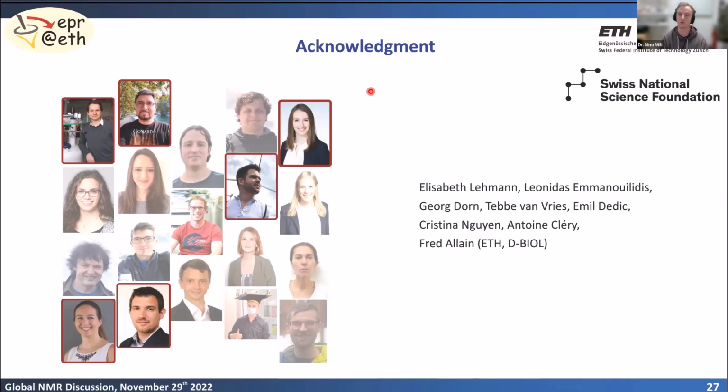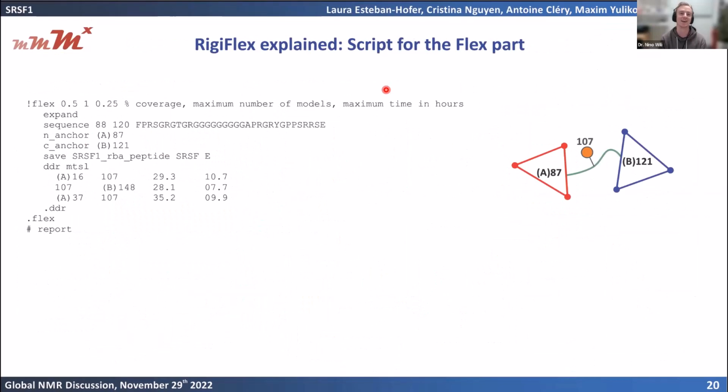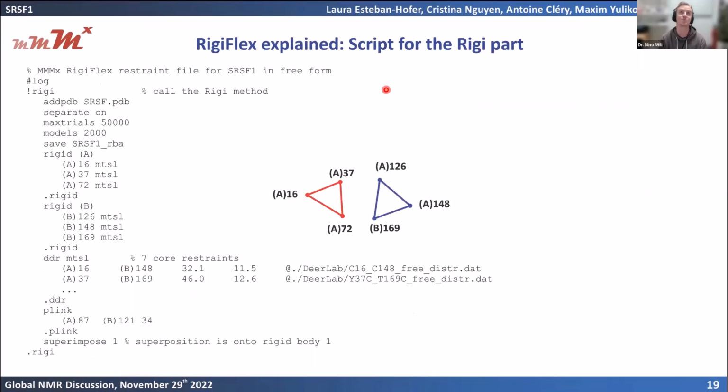So when you showed the DEER lab and neural net, you get some kind of error estimate in the distributions, and they are not necessarily the same. Can you comment on how much this influences the actual calculation in the end? Is this even that important?